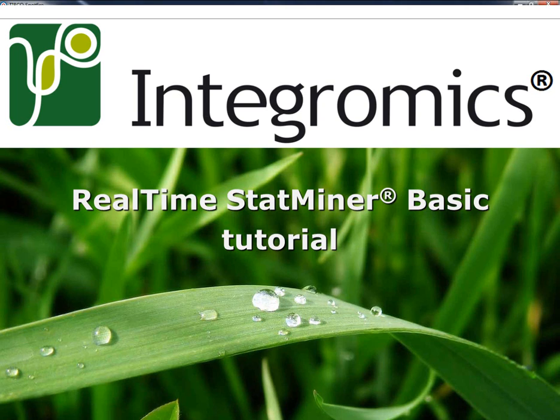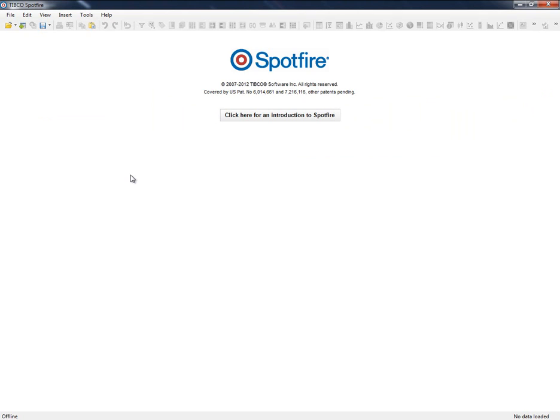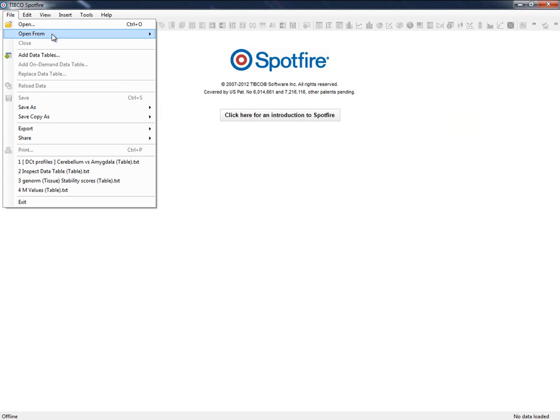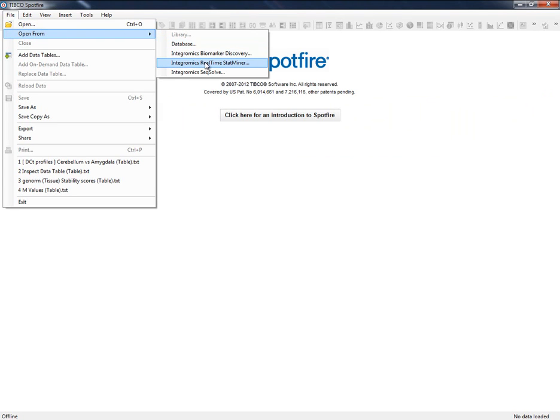Welcome to the video tutorial on how to use StatMiner for the TIBCO Spotfire application. This tutorial will give you an overview on how to start working with StatMiner, including preparing an example analysis from the qPCR wizard and getting all the quality reports and differential expression results based on the default analysis settings.